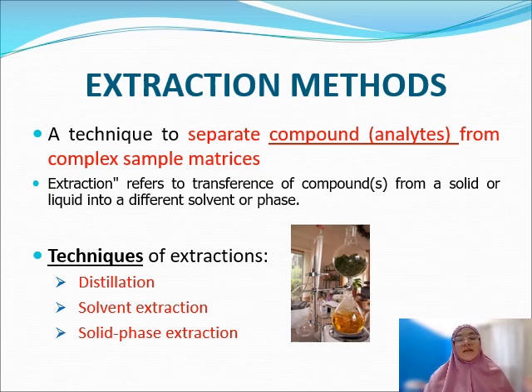The techniques of extraction and the types of solvent can be identified by referring to articles, journals, or previous studies. For the techniques of extraction, we could use three types of techniques. First is distillation, second is solvent extraction, and number three is solid phase extraction.